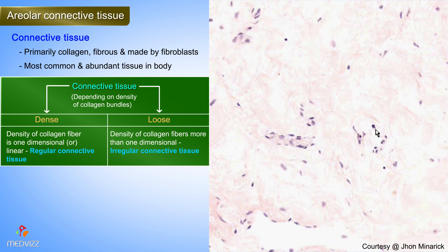This is a classical example of areolar or loose connective tissue. Before we close — do you feel that you can identify absolutely everything within connective tissue? If the answer is yes, then we have fulfilled our mission, and that's what we plan on doing with all of these slides.